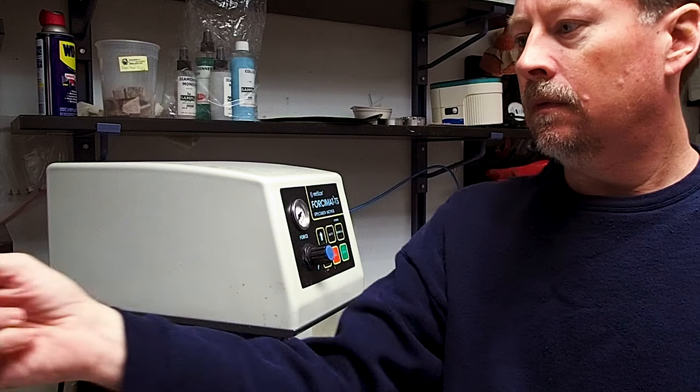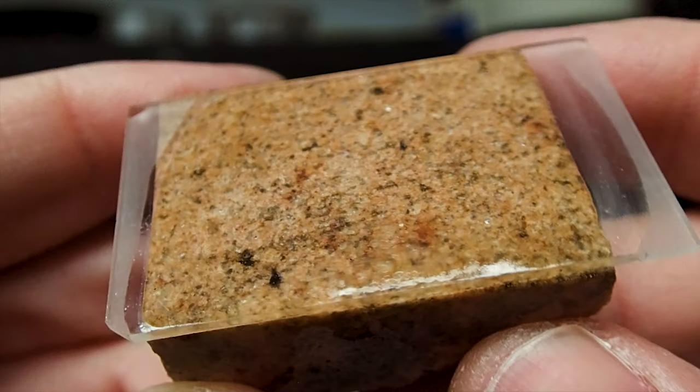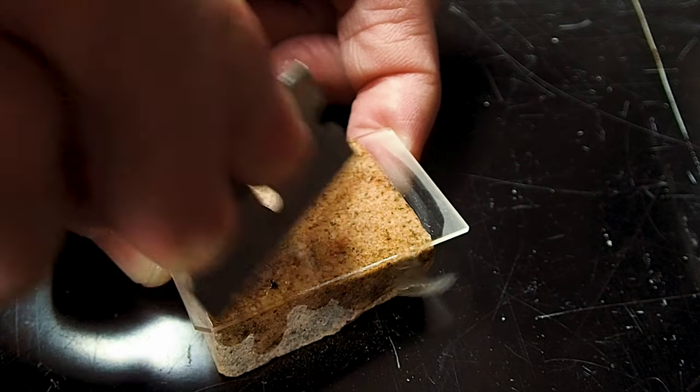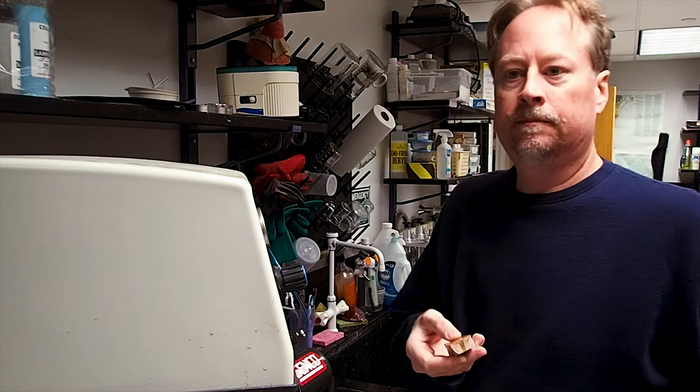During the epoxying process, it is not unusual to occasionally end up with some dried epoxy on the slide. This will prevent a tight, firm seal between the slide and the vacuum chuck, so any epoxy will need to be removed. A razor blade works well for this and can be used to easily remove any dried epoxy that you find on the surface of your slide.